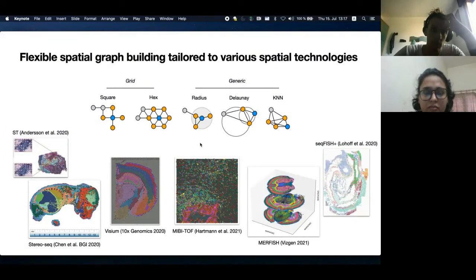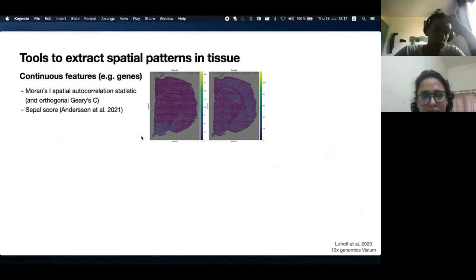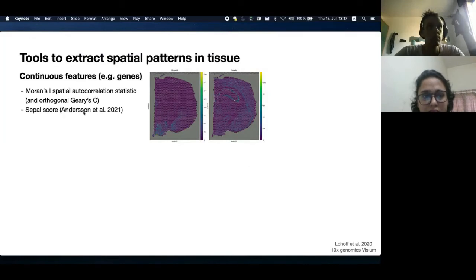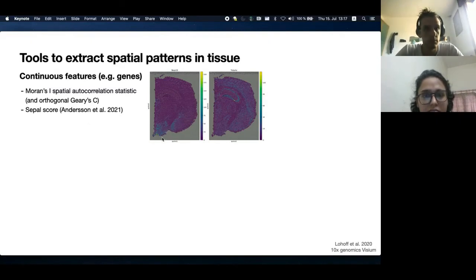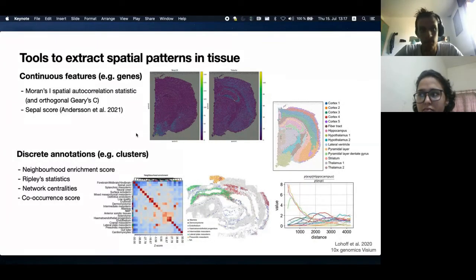On the spatial graph, SquidPy provides several tools to extract spatial patterns from the tissue. In terms of continuous features, often called spatially variable genes, we provide methods to identify them. Here I'm showing examples of two genes found to be spatially variable in the coronal section of the mouse brain in a 10x Genomics Visium experiment. We also provide tools to identify spatial patterns in terms of discrete annotations such as clusters.